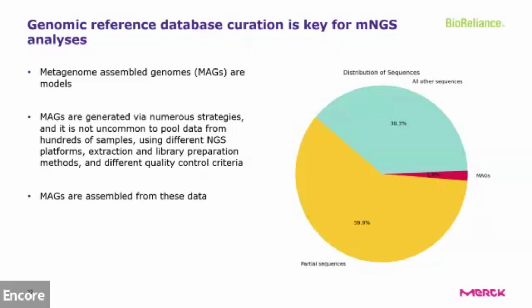And then partial sequences as well. We have seen instances where we had unspiked samples, but we did find FELV at the beginning, and we were like, how is that possible? Then we saw that in GenBank, it was a partial sequence. It was actually the human receptor for FELV labeled as FELV. If you take out that partial sequence, then unspiked data looked as expected. That's just the tip of the iceberg. I'm not part of FT Group C, but I should be. Let's talk about that more. But I do feel that K-mer analyses are more sensitive to troubles with the database than read mapping. You just need to be aware of that and do your curation.